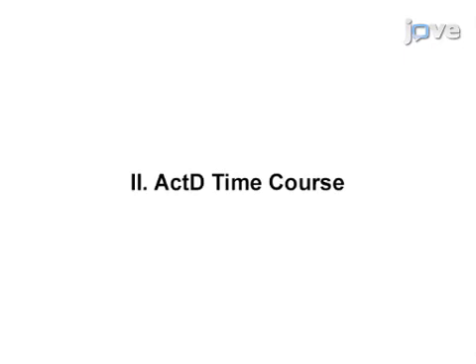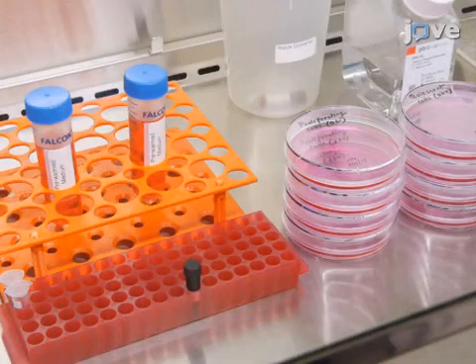To begin the protocol, establish proliferating and quiescent cultures of fibroblasts. Proliferating fibroblasts should be trypsinized regularly. Quiescent cultures can be established by allowing plates to reach confluence with regular medium changes.